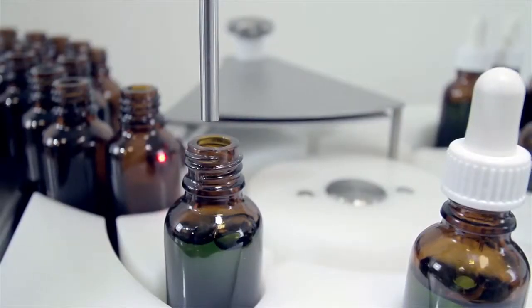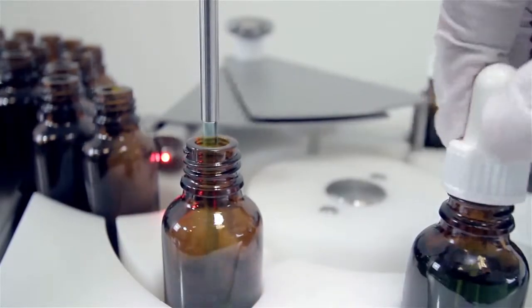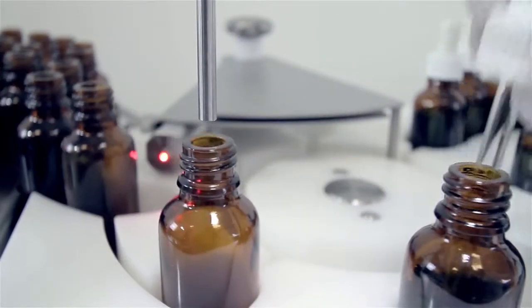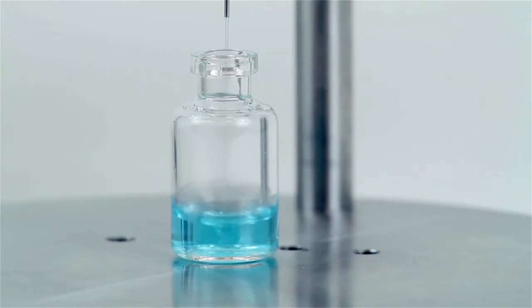Foaming, splashing, or dripping between each fill is always unacceptable. The adjustable fill speed and acceleration of the PF6 filler prevents splashing and foaming, while dripping is stopped using a back suction function.